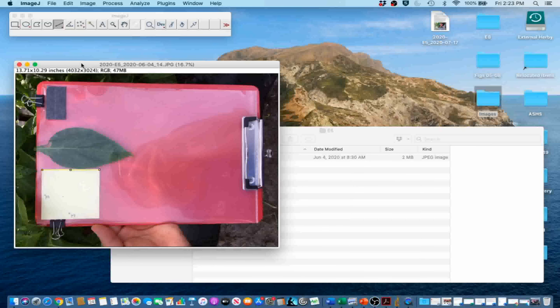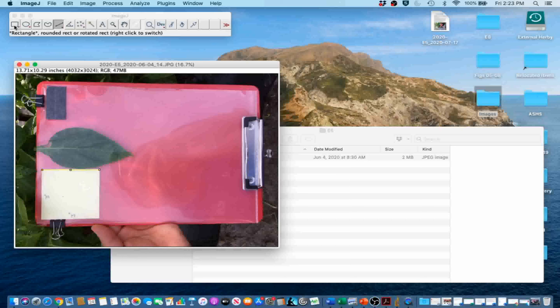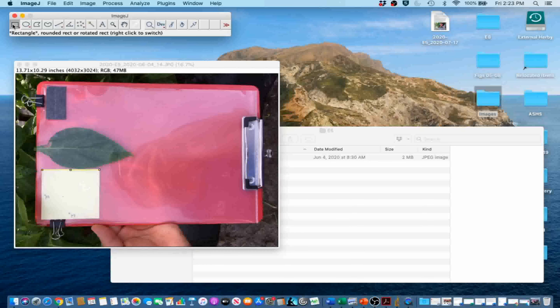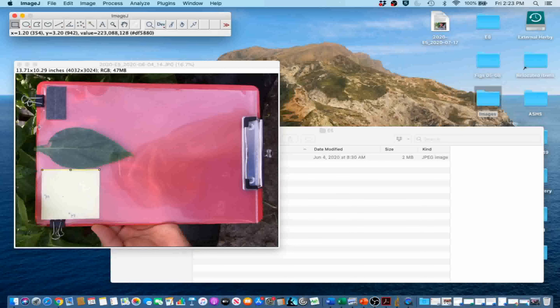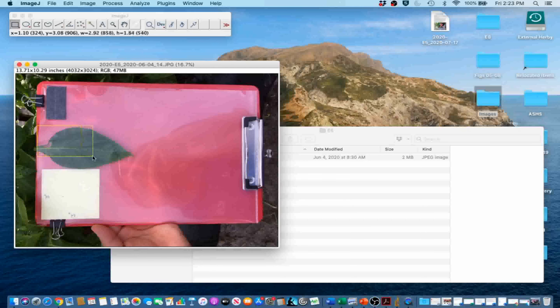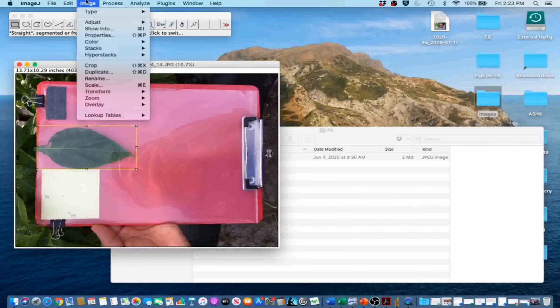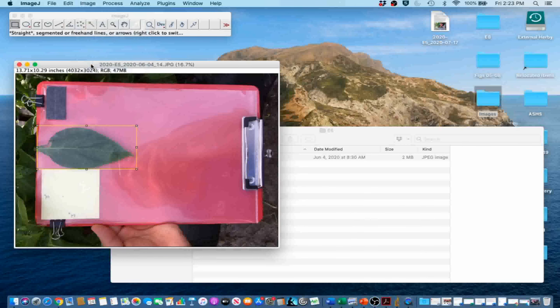Now that our image is scaled, in order to crop the image we are going to first select the rectangle tool. We are going to use it to select the area of interest. We are going to make the smallest rectangle we can around our leaf. Next, go to Image and Crop.